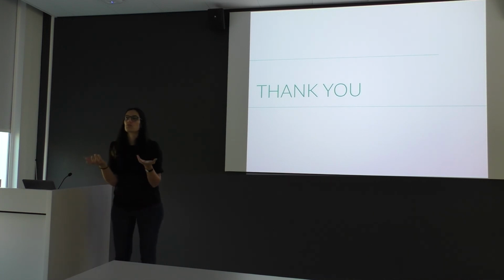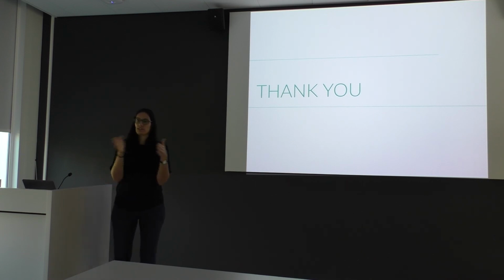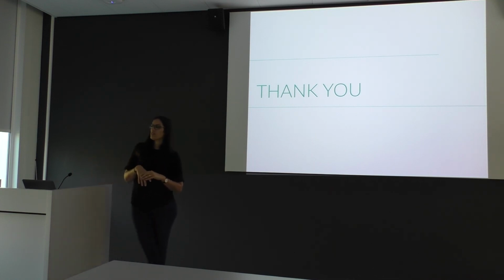If you're working with a ribosome, a little bit of grain will not hamper the quality of your data. But if you're working with small proteins, and that grain starts being the size of your protein, then you of course get into big trouble. So at the beginning, our take-home message was no longer than 2 days, which was of course very bad because just collecting data took so much longer. So we had to trash very good grids at the beginning, but now it's much better. Now I think we even do 4 days, right? But after 4 days we normally stop. Yeah, but 4 days I would say is still okay.